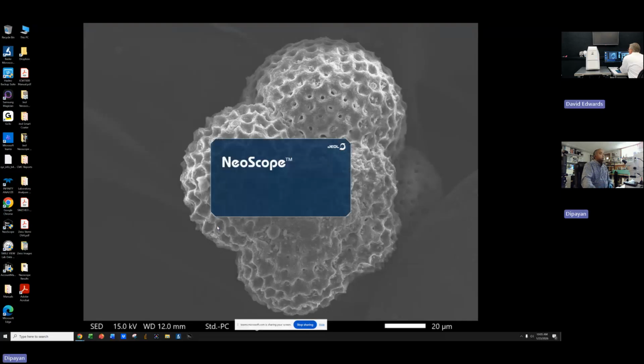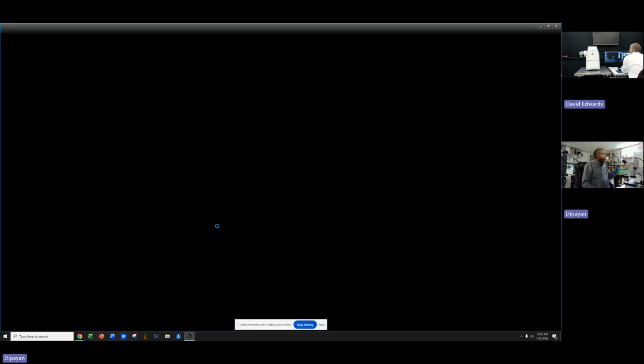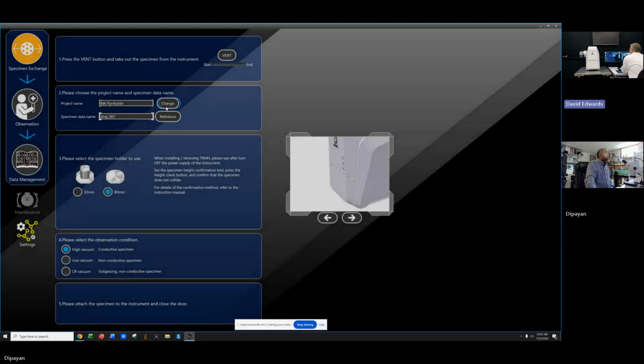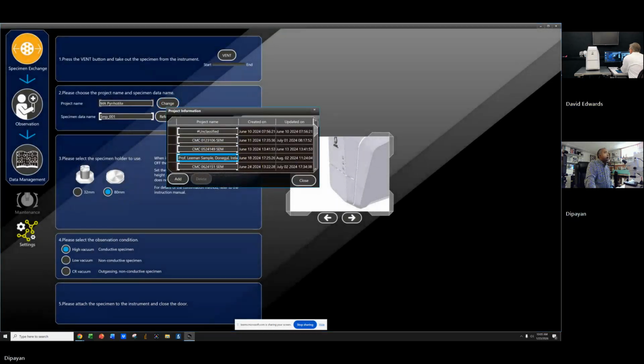Okay, so now you want me to press the sound program. You've got to power up the switch on the floor. Yeah, I did. I just waited a minute or two and then I powered on. And then the SEM's power. Yeah, then the SEM power. Okay, so now you just cancel eco mode. Oh, that's my eco mode. Where is the session? I have to create it. There we go.